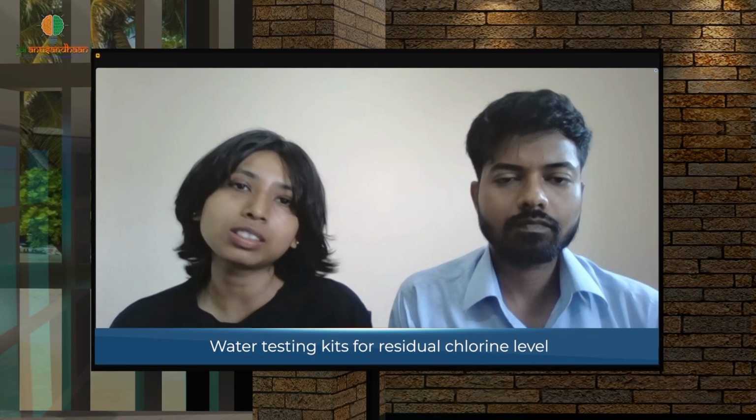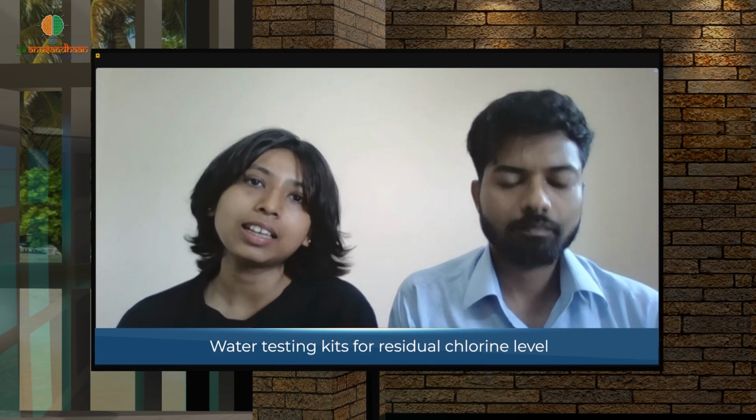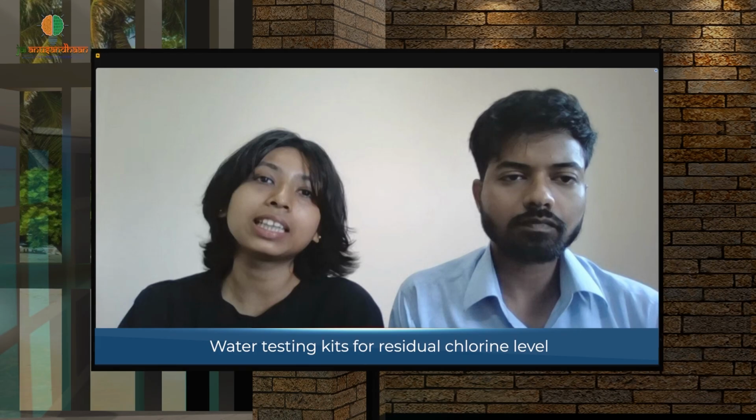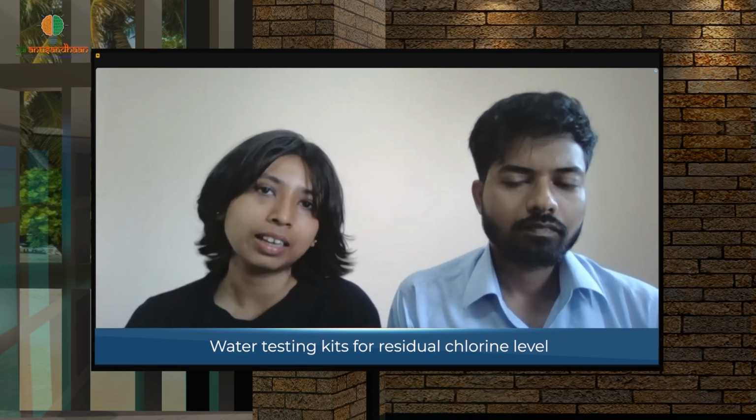Yes, and it is costly too. Whether you do it in the lab or not, it is costly. Even there are sensors available for E. coli bacteria, but they are too costly. It costs around 1 lakh to 2 lakhs. Okay, so to tackle that, you decided to develop a kit which could do it instantaneously at that particular point only, and also reduce costs.